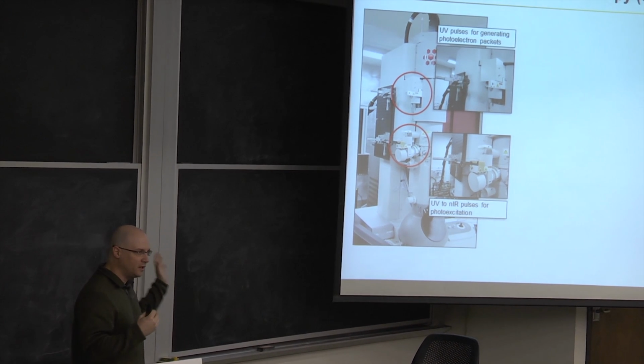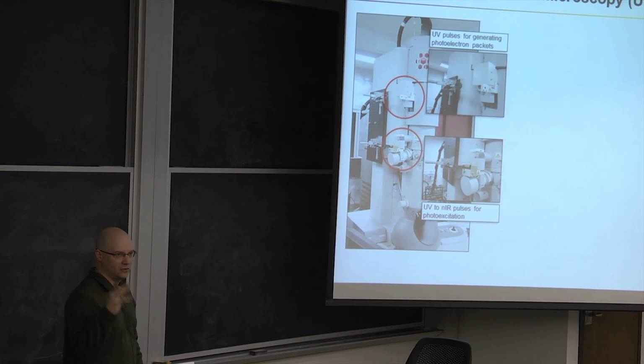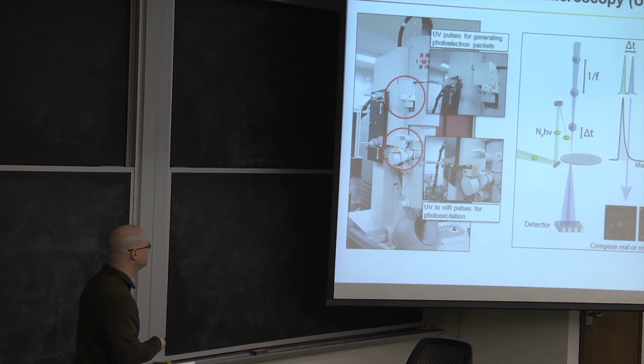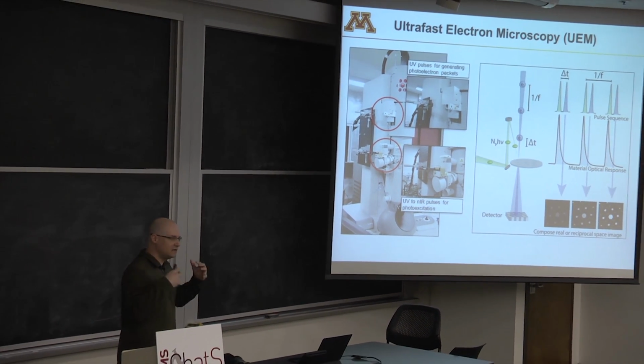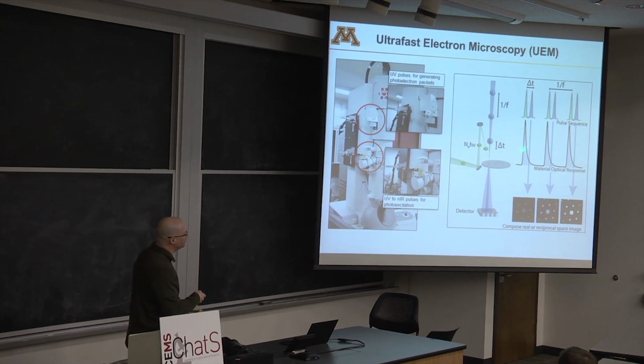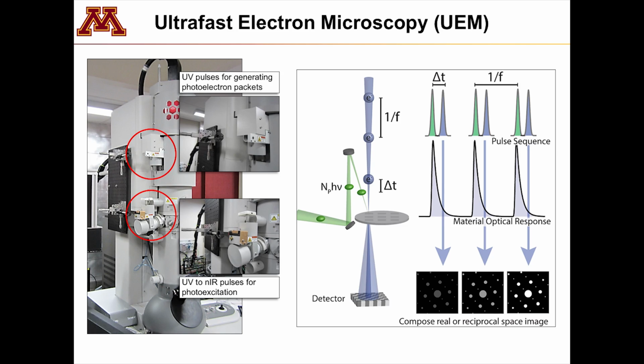So if I use a 100 femtosecond laser to do this process, my time resolution is 100 femtoseconds. Okay? Everybody with me? Okay, good. This is just the concept now that we would do. And imagine this process, this material response has some, let's say this is intensity of something as a function of time. That's kind of what you're looking at here. And it might have this shape.